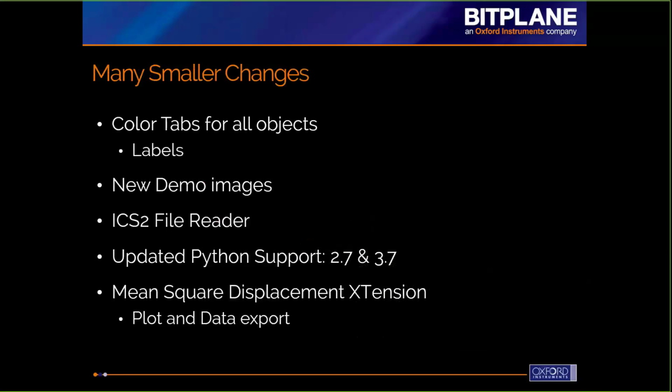Okay, then there's, I am finishing soon, I promise. And so then there's a collection of other new things that are within this release too. We have, again, the color tabs have changed so that you have material presets and you have those spheres that give you a preview of what they'll look like. You'll see that in filaments, cells, and spots.